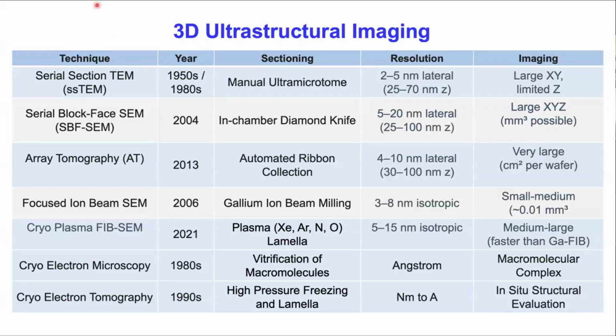Time, there is one technique called serial section TEM. In the 1950s to 80s, we had to do manual ultramicrotomy, section it, and then you can get the images and stack them for 3D imaging.